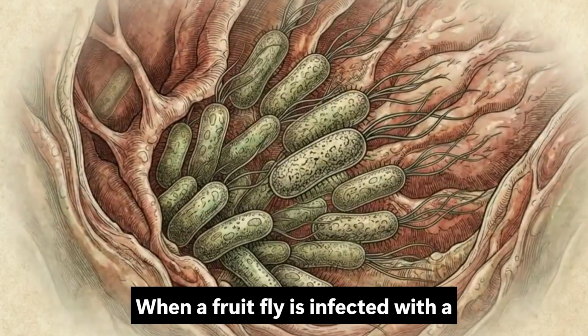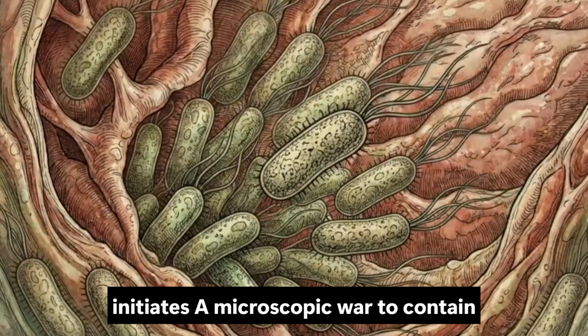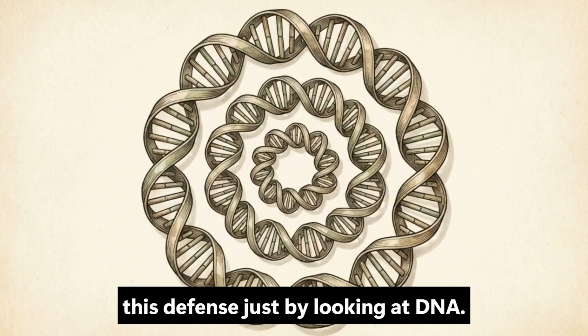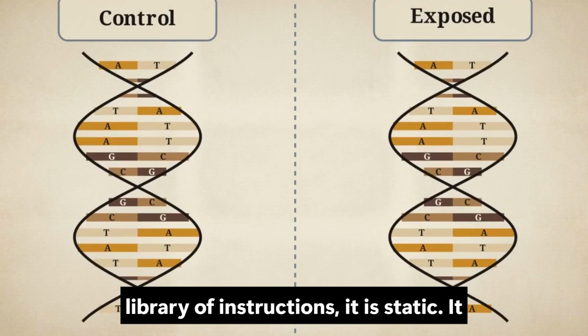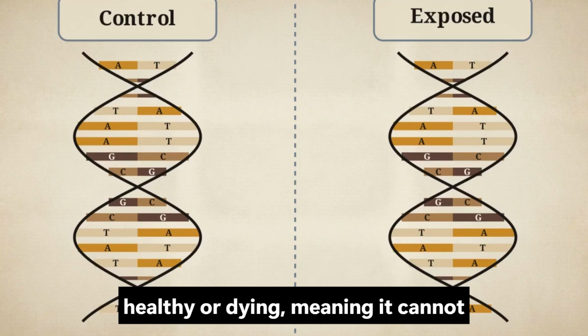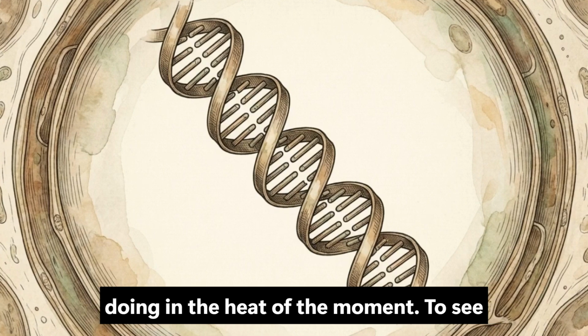When a fruit fly is infected with a lethal bacterium, its body immediately initiates a microscopic war to contain the invader. We can't see the strategy of this defense just by looking at DNA. While the DNA holds the cell's entire library of instructions, it is static. It remains the same whether the fly is healthy or dying, meaning it cannot reveal what the immune system is actually doing in the heat of the moment.